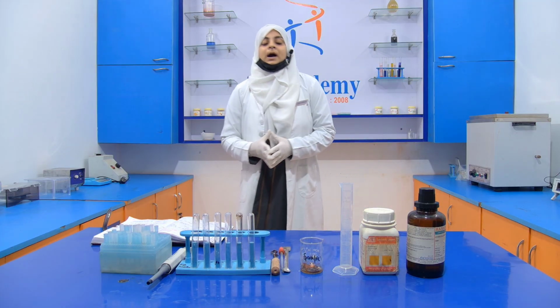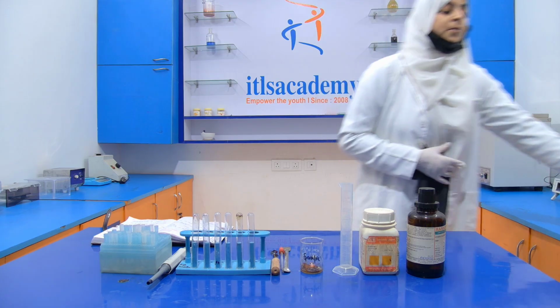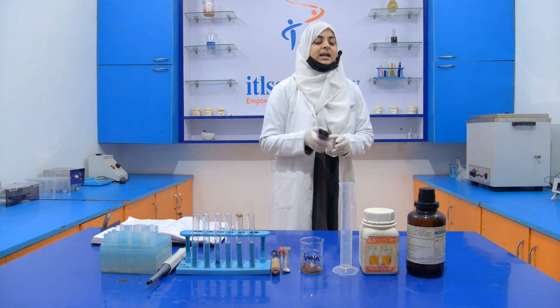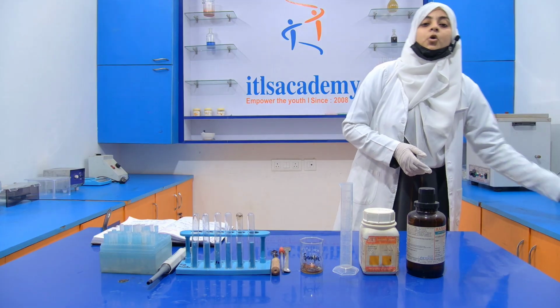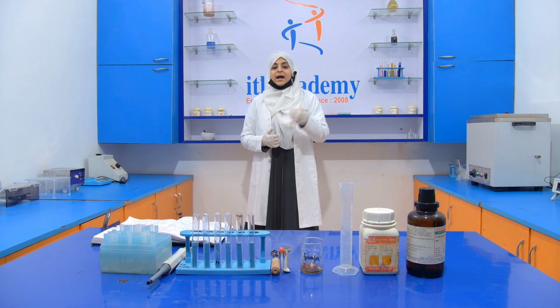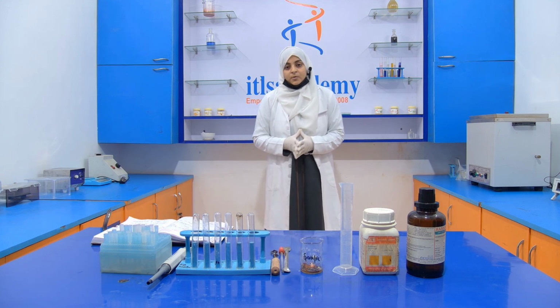Now again we are using concentrated HCl, so we have to take extra care, because concentrated HCl is corrosive in nature. So we have to avoid direct contact with it.